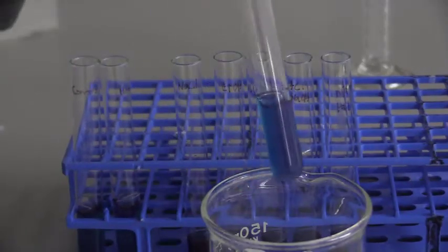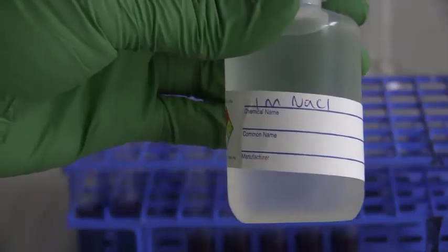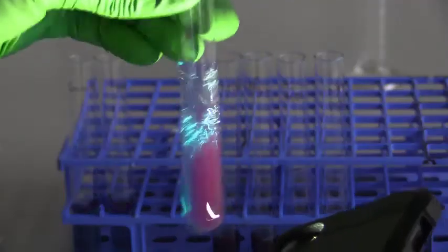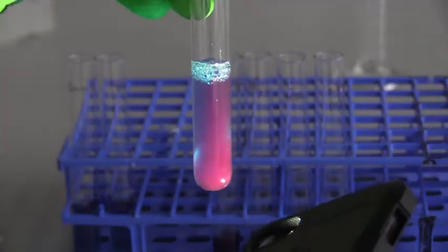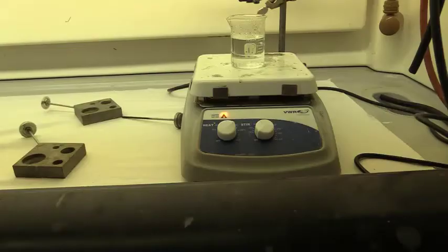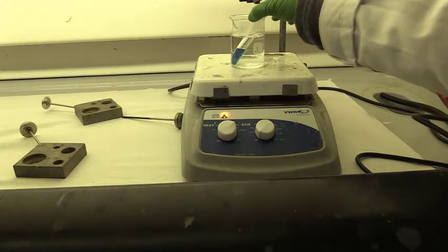I'm going to put one tube on ice for a few minutes, and then I'm going to add 2 mL of sodium chloride to the tube. And you could observe if there's any changes here. Fill out your observations in the table. My water bath is hot now, so I'm going to put that tube in there for a couple of minutes.